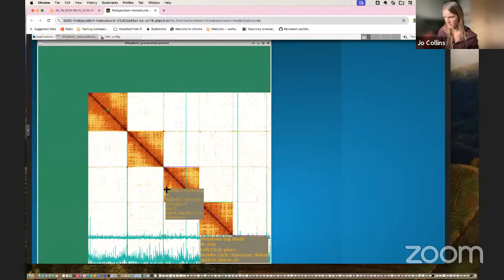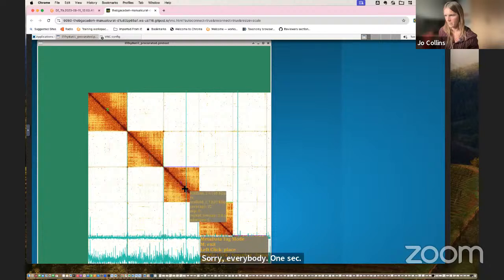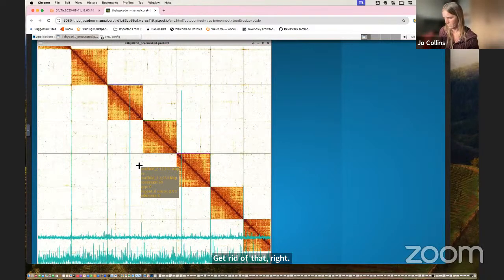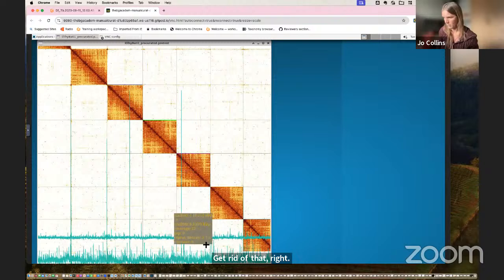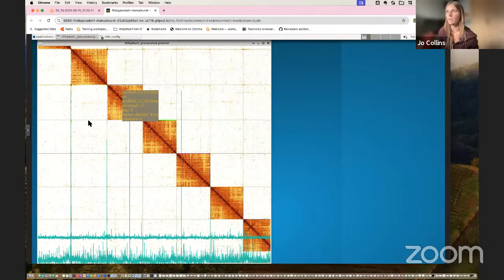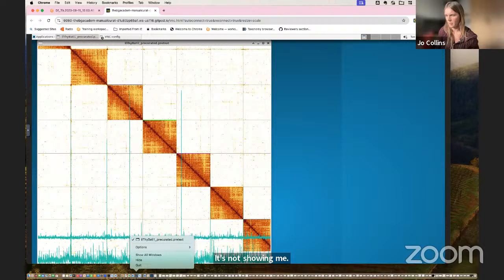One second. Get rid of that. Right. Let me press M again. It's not showing me. I'm going to show you what you should be seeing.